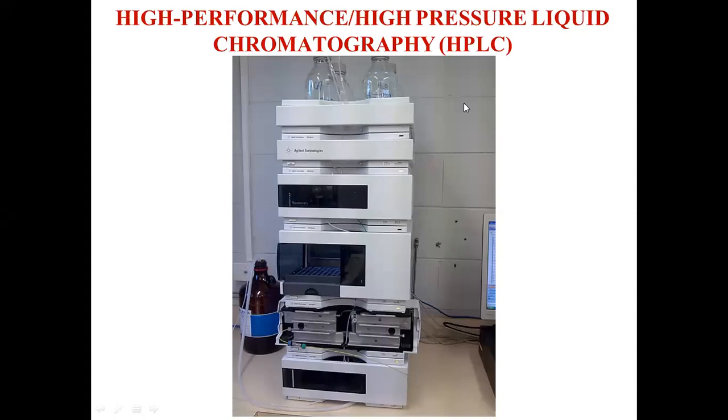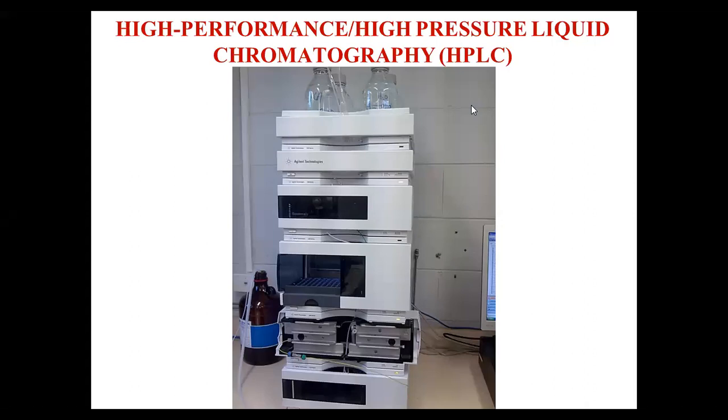The role of the mobile phase is to carry the solute molecules through the chromatographic column. The solutes are going to be separated based on the partitioning between the stationary phase and the mobile phase. One of the primary requirements for the separation of solutes in gas chromatography is that the solute molecules have to be converted into their gaseous state. By increasing the temperature, we will convert the solute molecules into gaseous state.